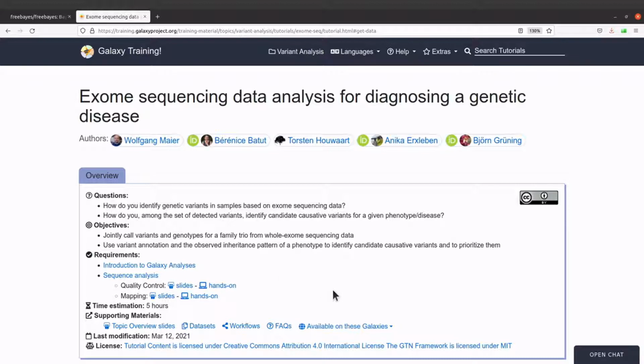So that is why I am reproducing this tutorial using command line tools, so that those who are beginners will get to be exposed to how command line tools work. So that's why I'm doing that. So let's proceed.